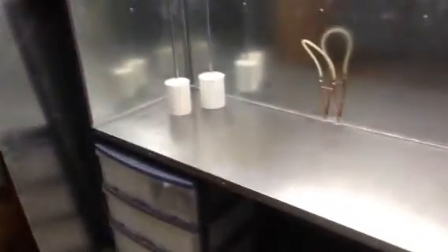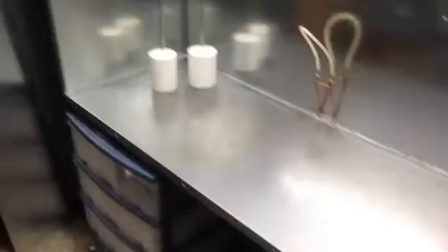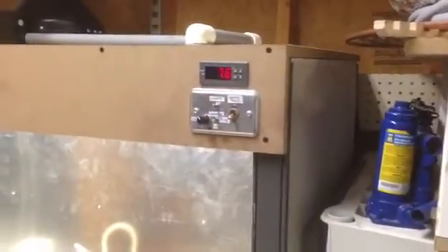Hello YouTube. I just want to make another video of the progress of my fume hood. It's coming along pretty nice. The last time you've seen it, it had no sheet metal on the sides, no cable on the top, so half of the stuff up here wasn't functioning.